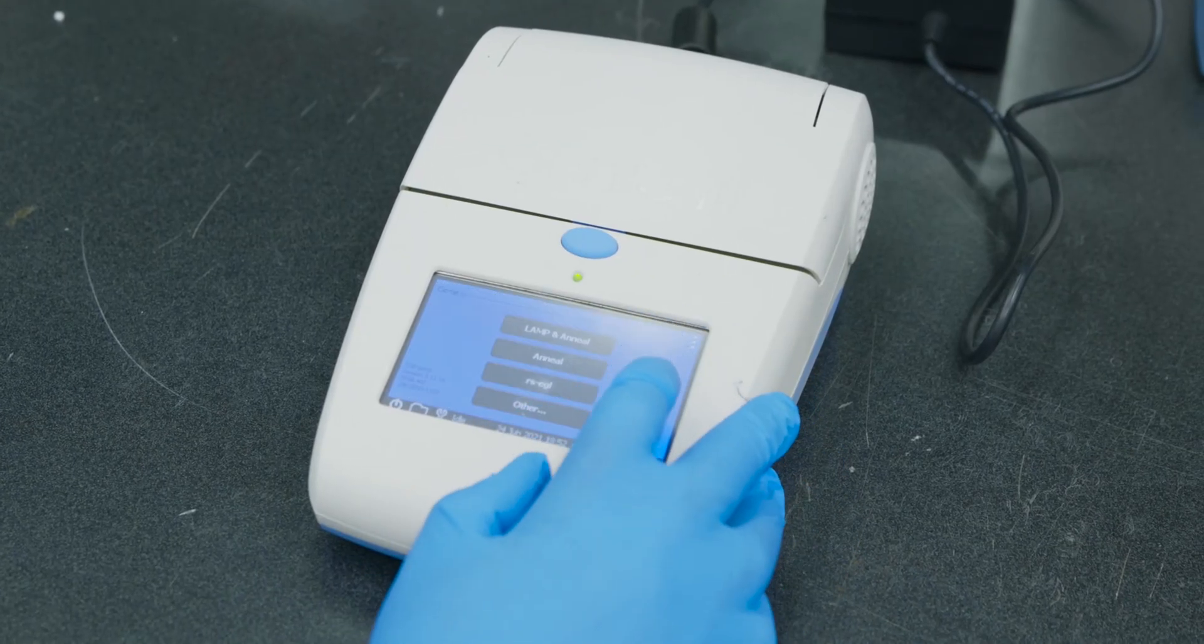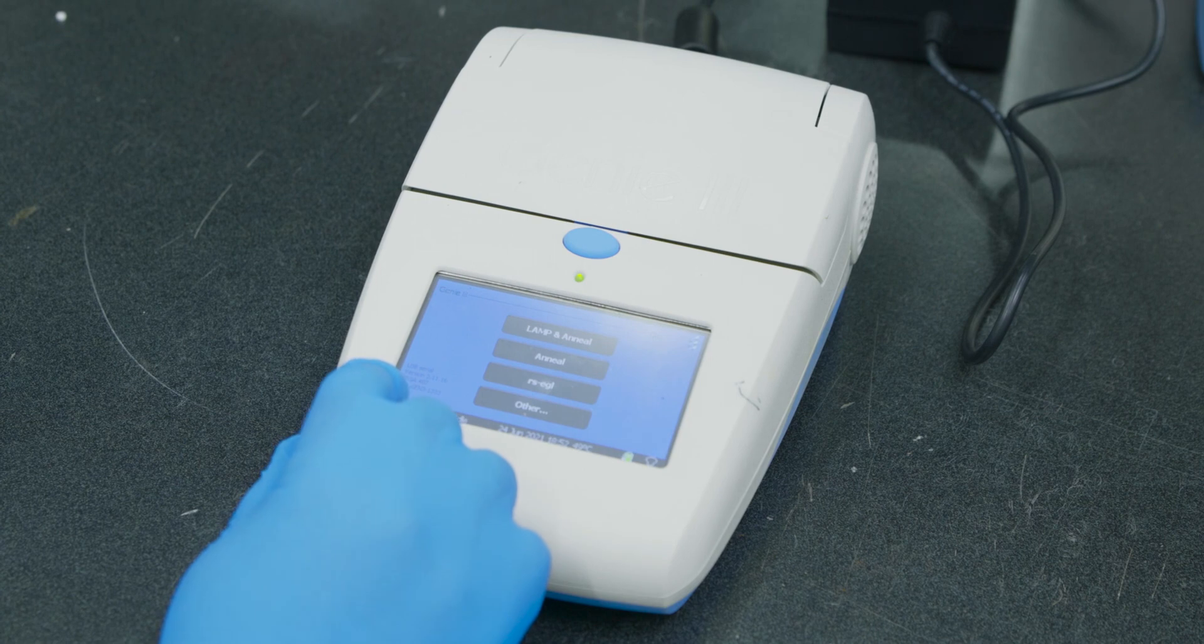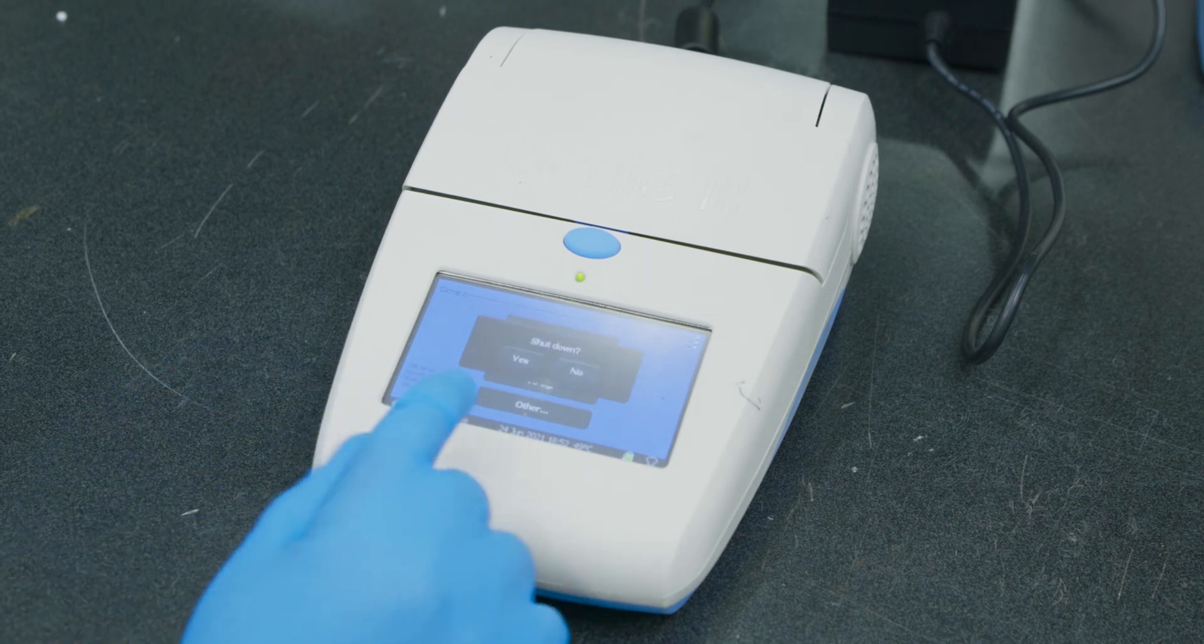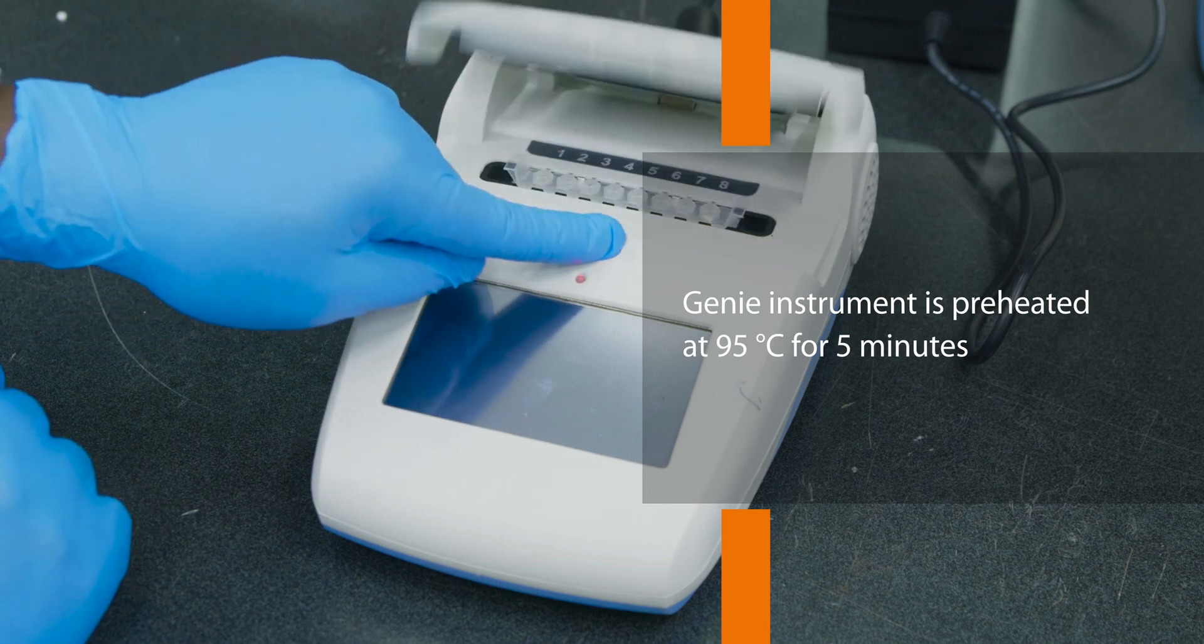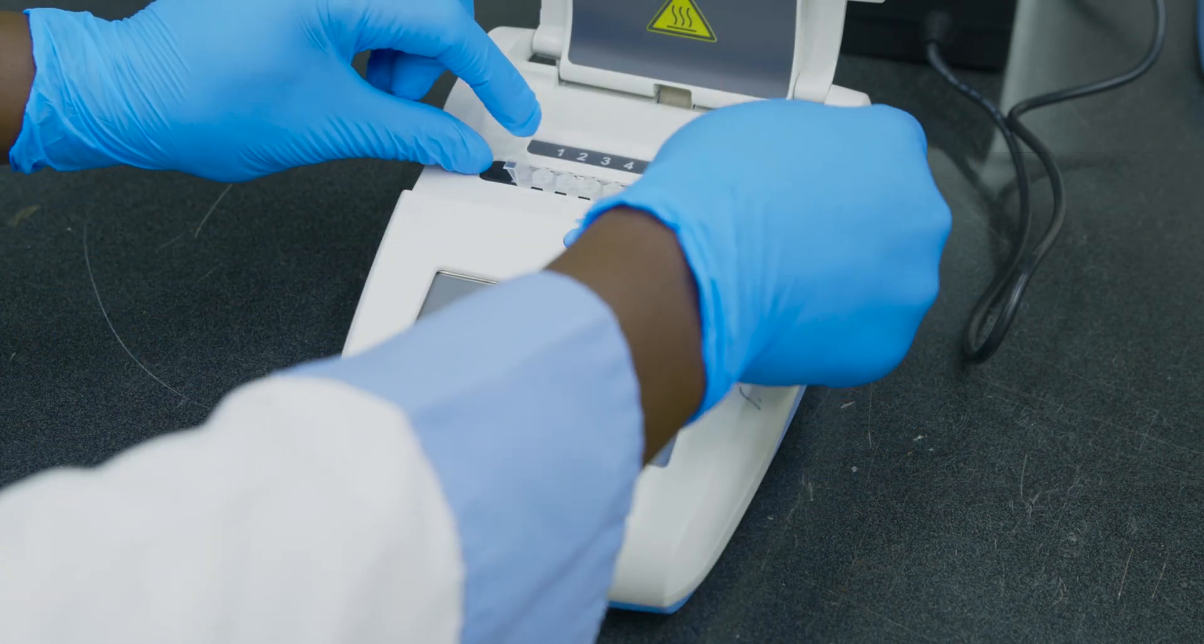If working in the lab, the alkaline PEG step can be avoided by using heat in lysing. In this case, the Genie instrument is preheated at 95 degrees Celsius for 5 minutes.